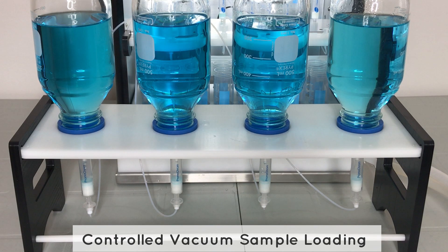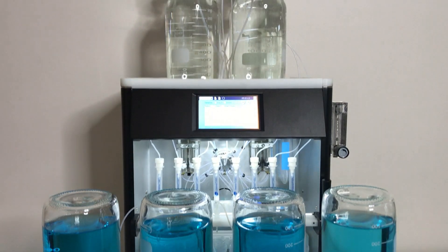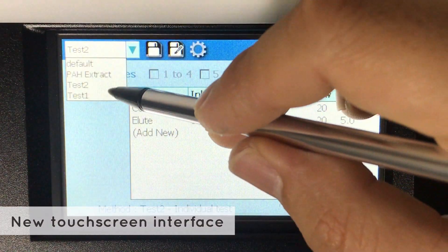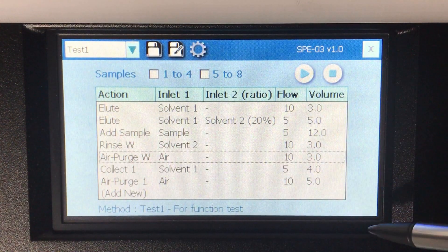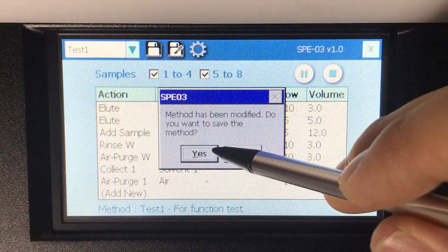Even controlled vacuum sample loading and two-column in-series configurations can be performed on this system. Now equipped with a new touch interface, it is easier to edit methods, select samples, and start the extraction process.